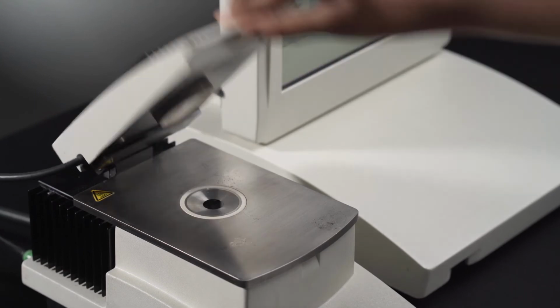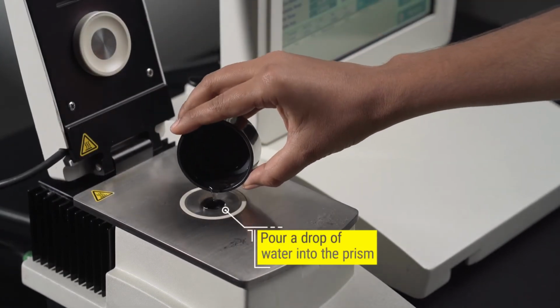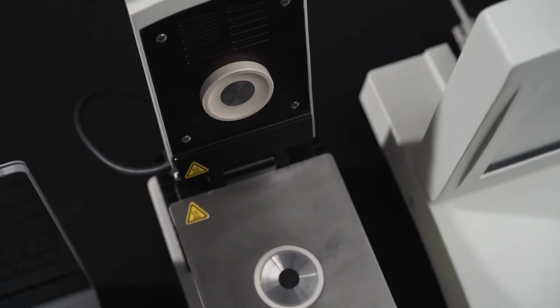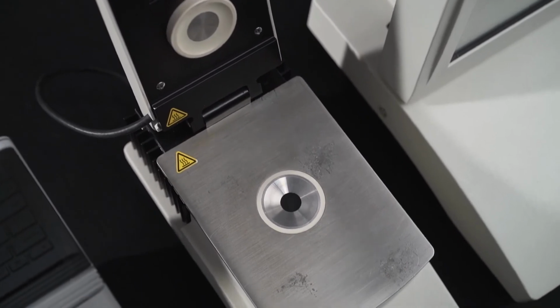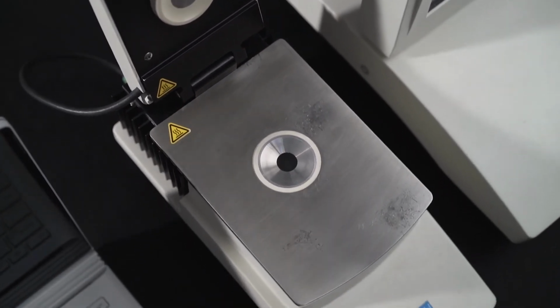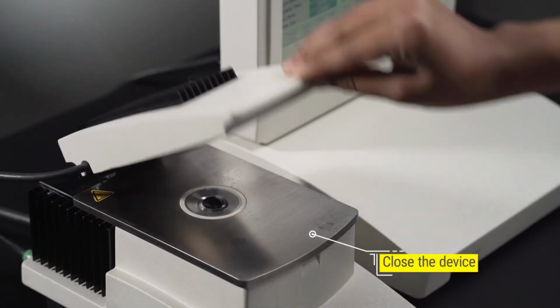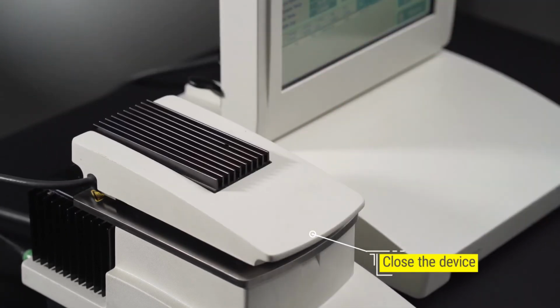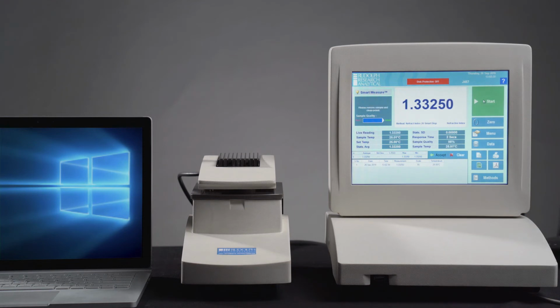Put the sample inside the device. Set the device for measurement and go to the instrument application to start the reading. Once the data is transferred, what is displayed on the instrument device can be checked on the SDMS screen. The data is captured in the SDMS screen and displayed as it was generated in the instrument software.